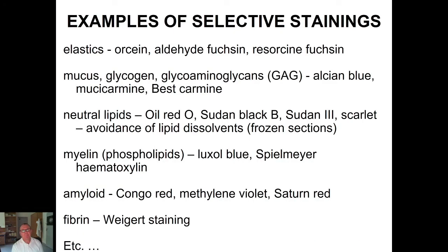substance. Selective staining. Selective stainings, as was already written, are used for highlighting some specific structures regardless of their location. Again, I would highlight those which are used in our box. You'll find there are several sections stained to visualize elastic fibers.